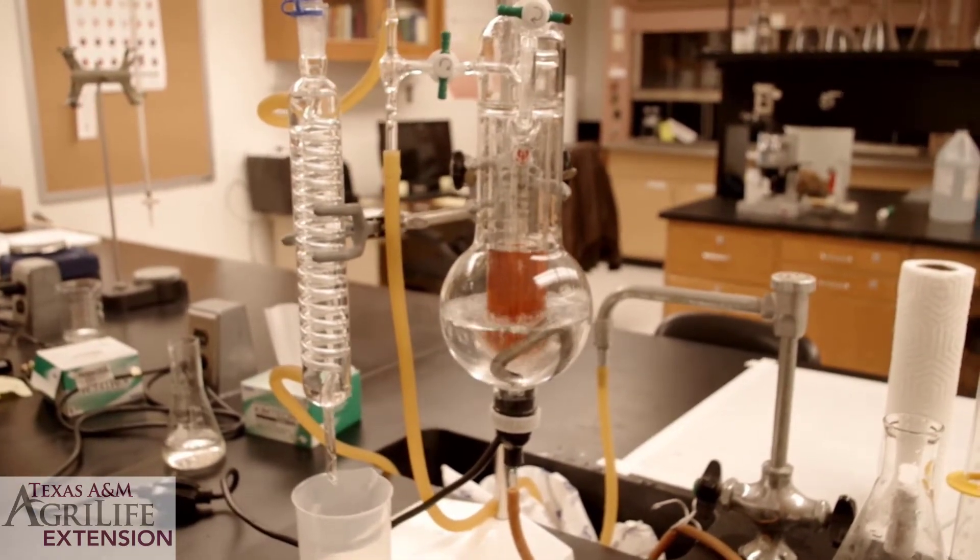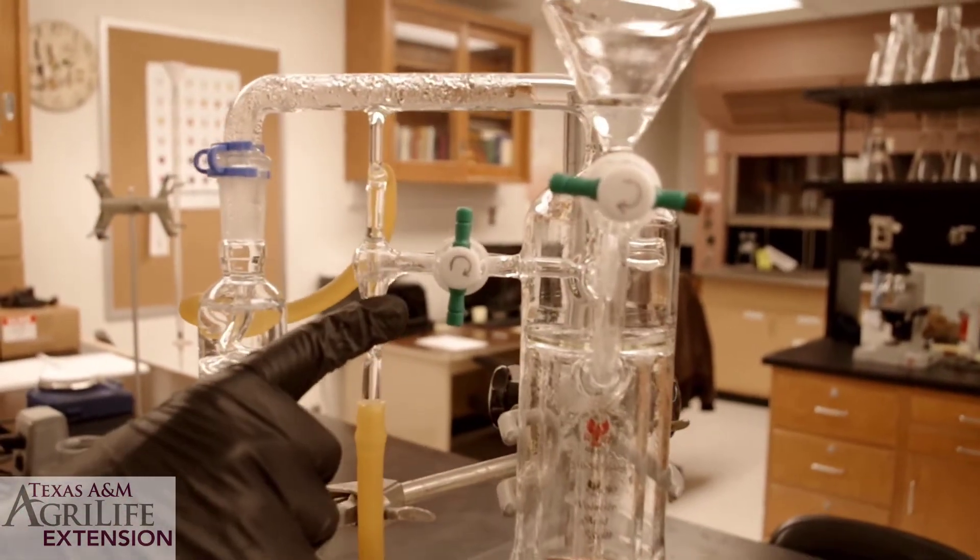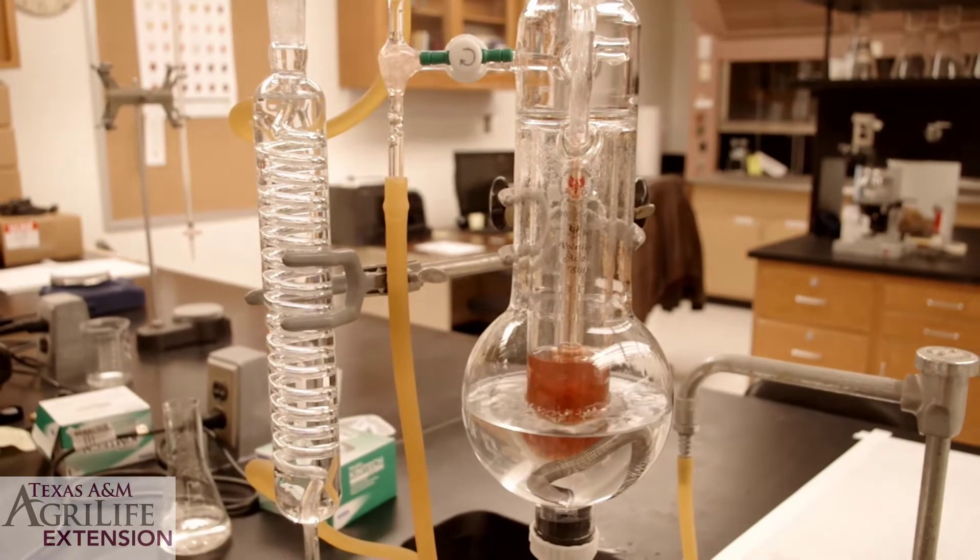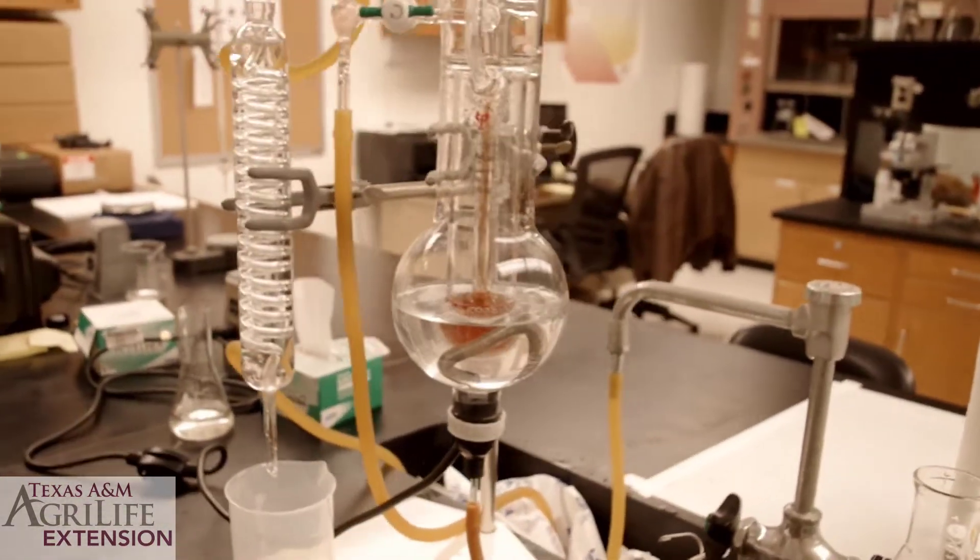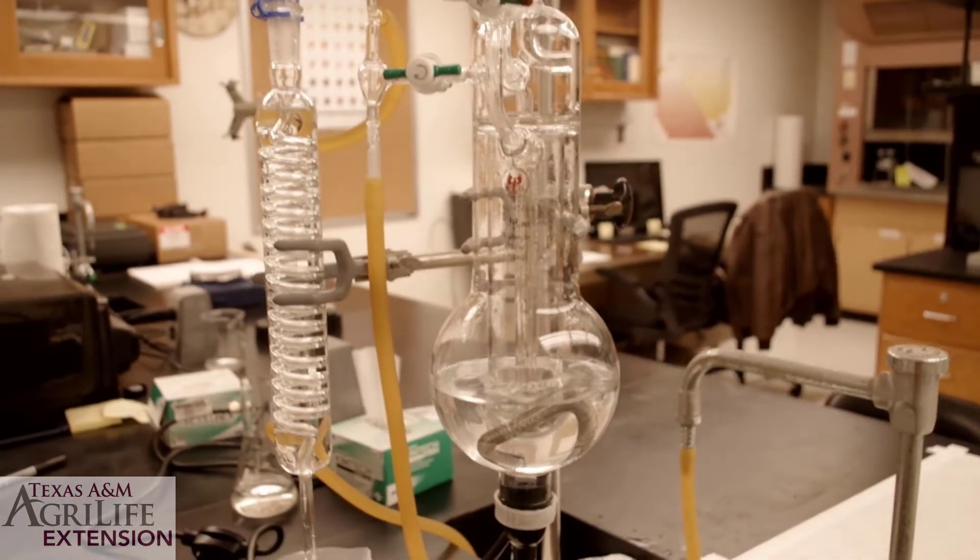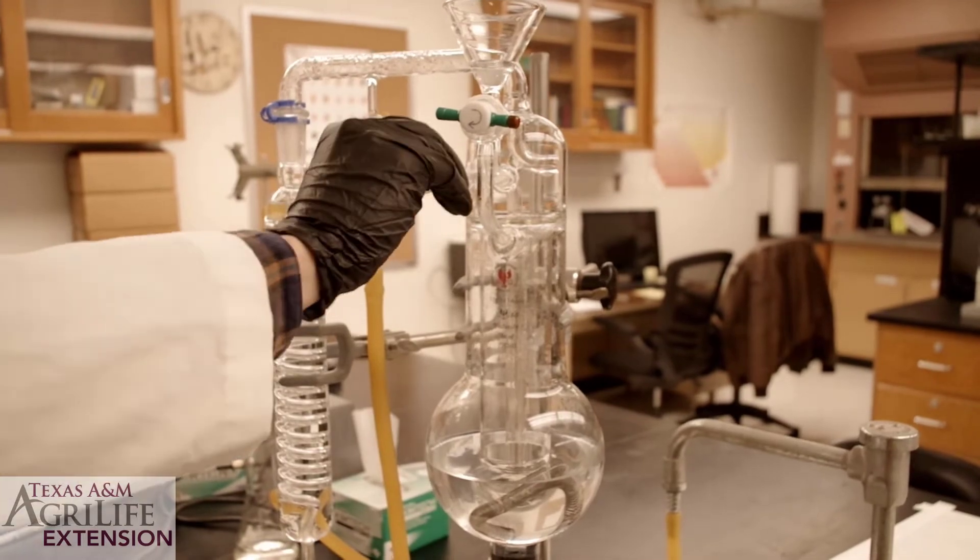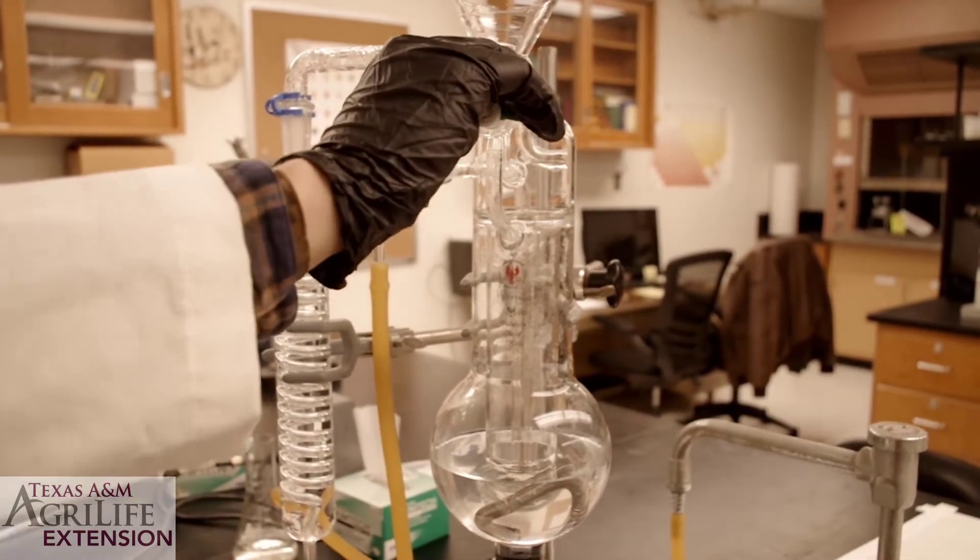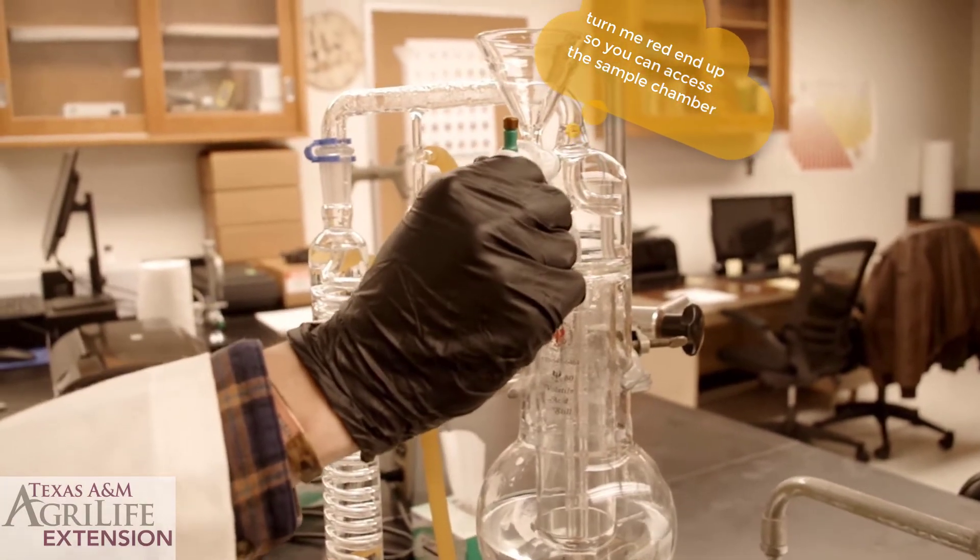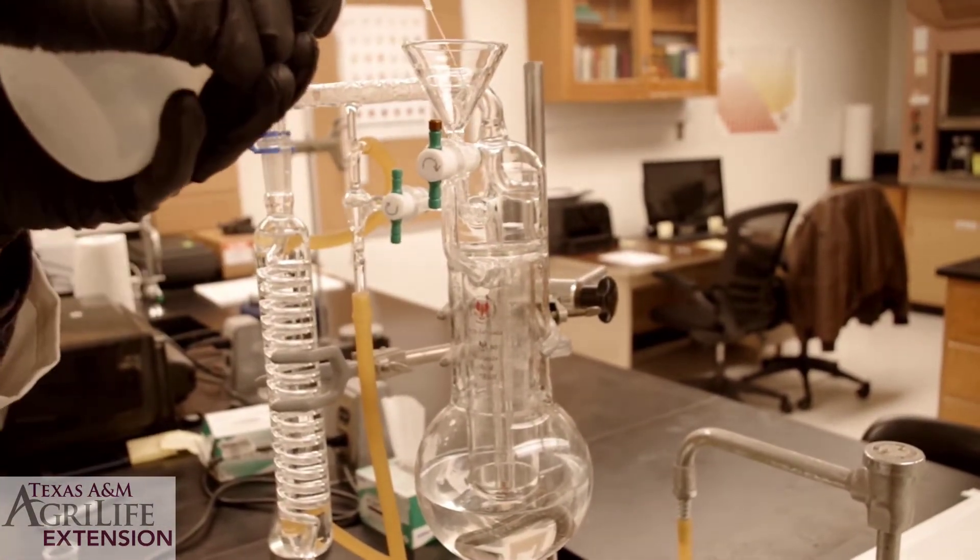It is now time to evacuate the sample. Turn the middle stopcock to the horizontal position. The sample will be evacuated through the middle hose into the sink. Time now to clean the sample chamber. With the middle stopcock in the vertical position, add distilled water to your sample chamber. Then evacuate. Repeat the process three times.